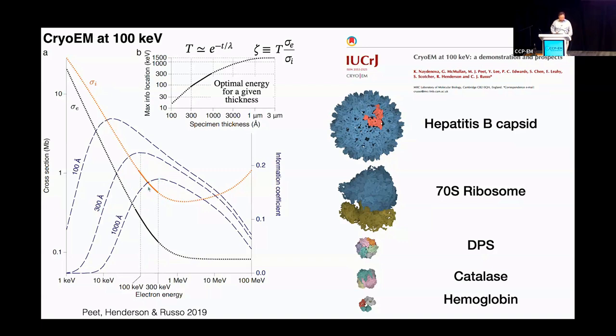But this is quite general, and it was based on old physical theories. But then we realized there weren't accurate measurements in this range. So the dark regions of these two curves of the electron scattering cross sections were actually measured by Matthew Peet in my group, so we became quite confident that they were very accurate, and they also matched our measurements of radiation damage.